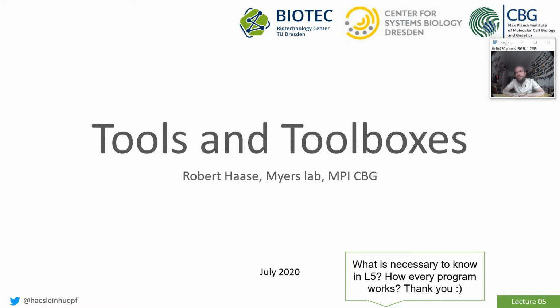And I'm pretty confident that earlier or later you will be confronted to microscopes and microscopic images, and you may want to analyze them. But I cannot predict of what kind of images you will be looking at in 5 or 10 years. And I can just show you different tools. So we will quickly go through these tools, and I will tell you in which situation you will use which tool. But at the end, there is no perfect tool, and there is no best tool. And at the end, it only depends which one is the right one and how much you should know about it depends on what you will do next.